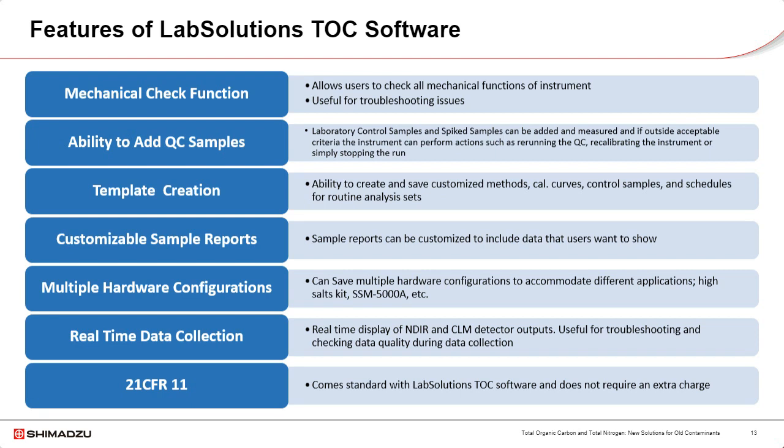Additionally, actions can be associated with these controlled samples or templates. So upon failing samples, the instrument can be triggered to do certain actions. You could have the instrument stop. You could have it go back and rerun that failing sample. You could even tell the instrument to go back, rerun the calibration curve, and start your analysis over from the beginning again. Or very simplistically, you could just have the instrument notify you upon the failure and continue on. So these are all cool because it turns your instrument into what I would consider a smart instrument.